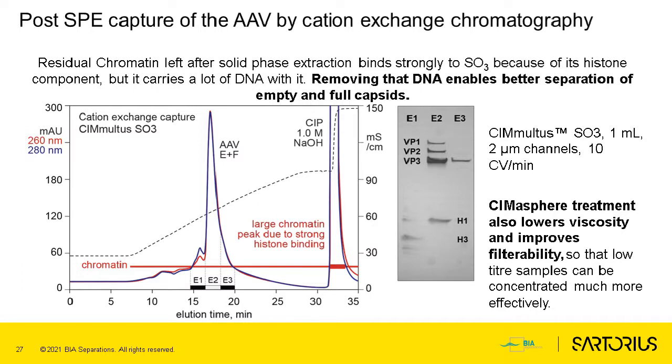So to really have extremely good removal of chromatin structures, the best would be to use very strong cation and very strong anion exchanger. CIP peak at the end, very big, shows that although we are using the solid phase extraction of chromatins, we still have quite some chromatins present. So really something to keep an eye on all the time.